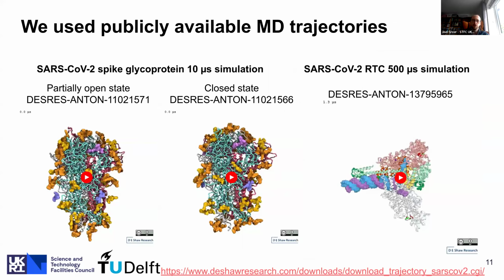Okay, so Roodmus allows us to generate datasets from MD trajectories. So what MD trajectories are we going to use in our investigations? To perform the studies that we show here, we've used MD trajectories performed by D. E. Shaw Research, published in 2020 from their MD simulations related to SARS-CoV-2. These are long simulations, which we hope to allow sufficient conformational heterogeneity to be present for heterogeneous reconstruction algorithms to actually be able to find representations of continuous heterogeneity.